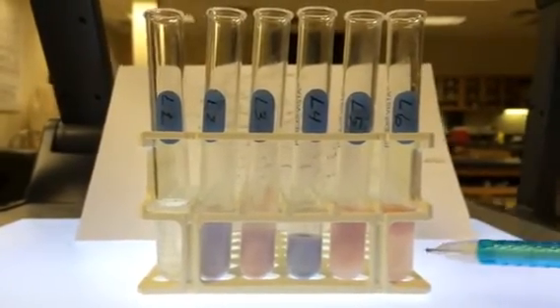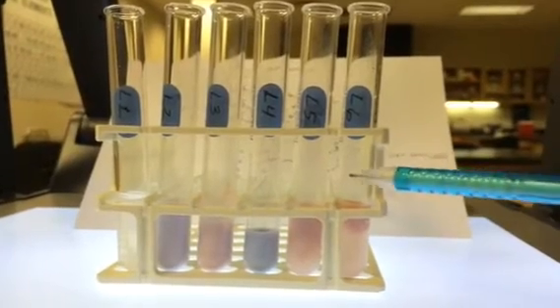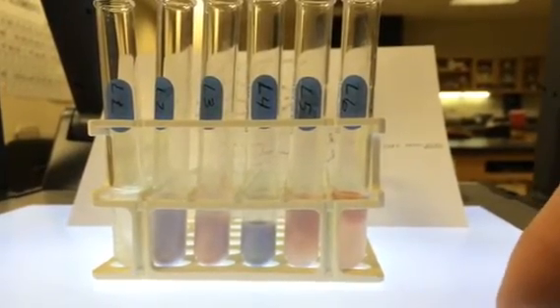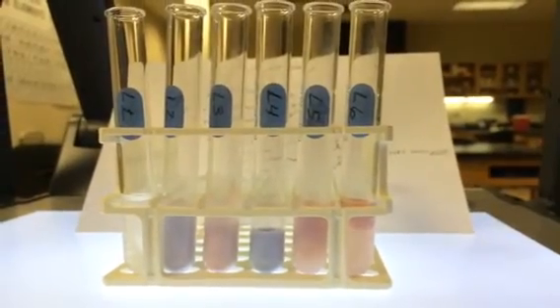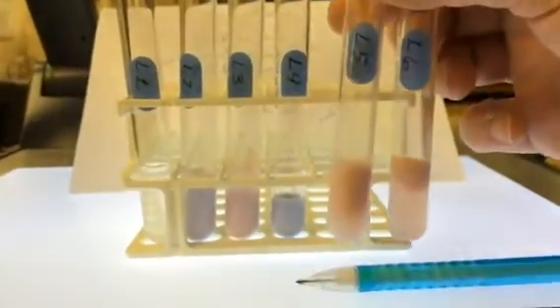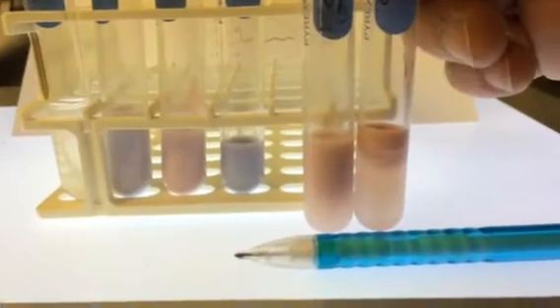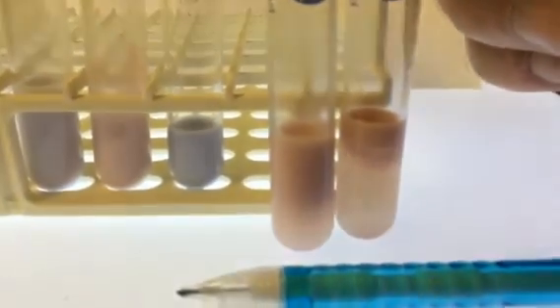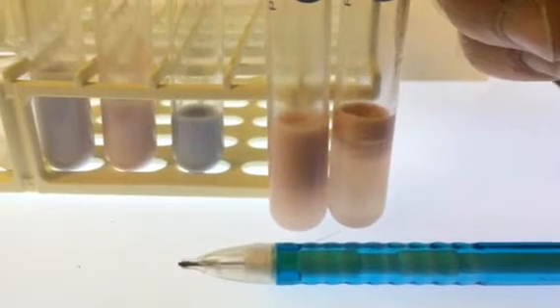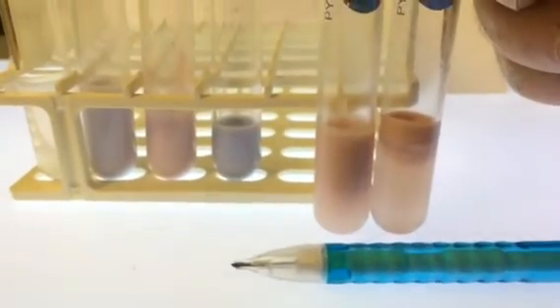In tube L6, you added litmus cream, lipase, and a pinch of bile salts. And again, you can see digestion occurred. I would expect, actually, more digestion to occur in tube L6 because bile assists with fat digestion by the mechanisms we've been talking about in lecture. By increasing surface area for lipase to work on. However, it's a little bit hard to see the results, partly because the bile salts are yellow. So they can kind of throw off the color a little bit. But I think if you look closely, you can see that tube L6 is actually a deeper tone of pink. Or if you can't, just use your imagination. Or maybe you'll see in lab that L6 actually is a little bit more pink than L5 when you get your results.